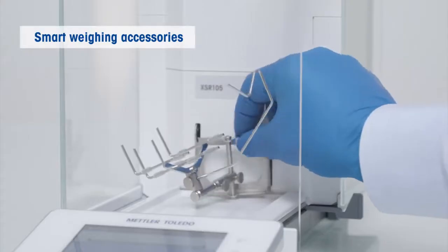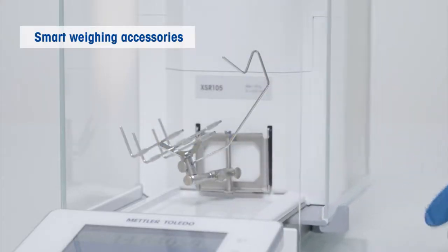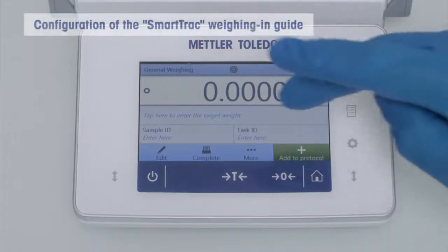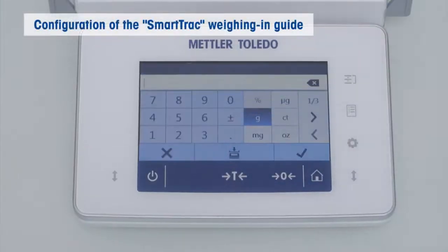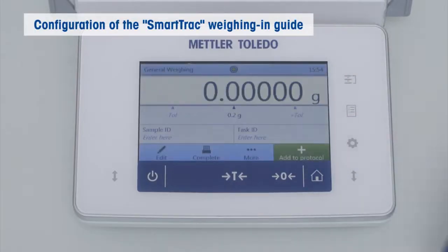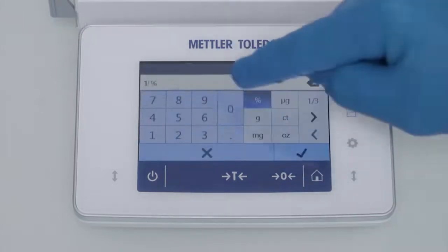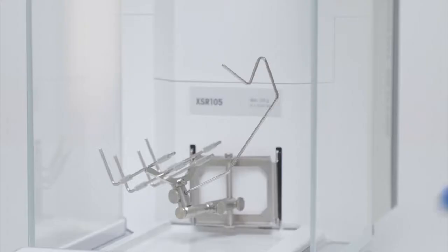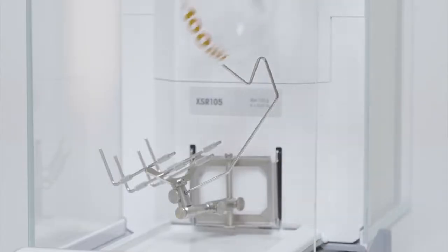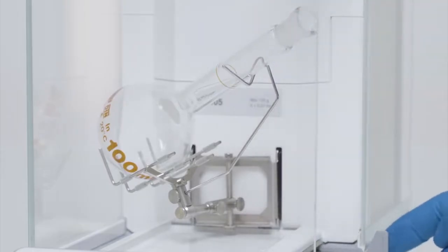To make your daily weighing tasks even more convenient Ergoclips can be used. To zero the balance place the tare container on the Ergoclip and tare it. Afterwards we dose in 200 mg of a substance.